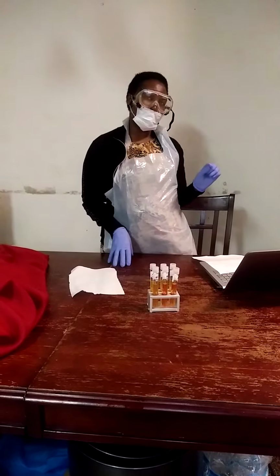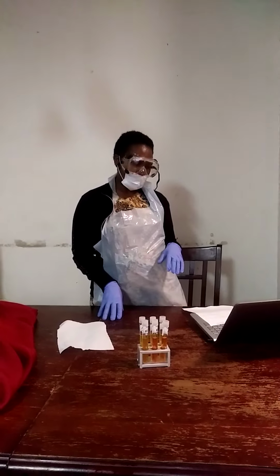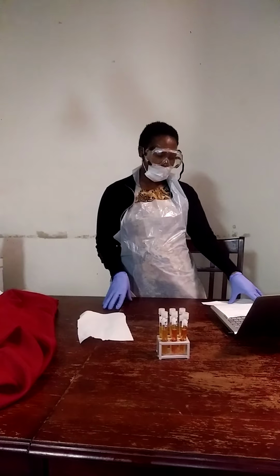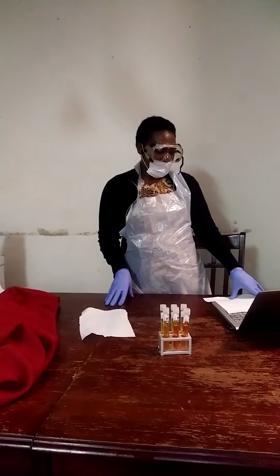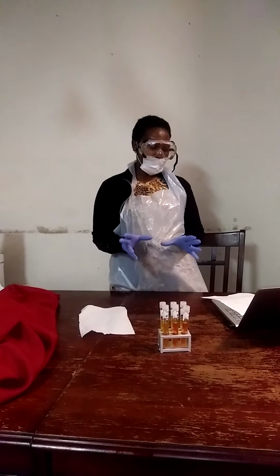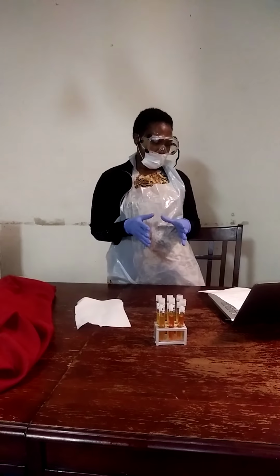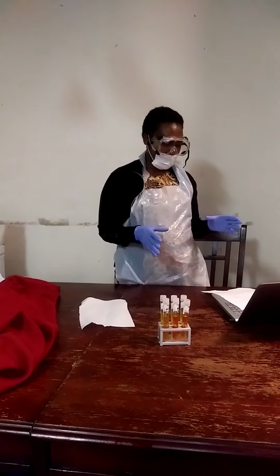And so I have some terminologies that I have to define concerning this experiment. Number one, what the purpose of biochemical testing is. This is to identify various metabolic properties of different bacteria species. And carbohydrate fermentation is a test used to determine the byproducts of fermentation, hence differentiating among groups of species of microbe.